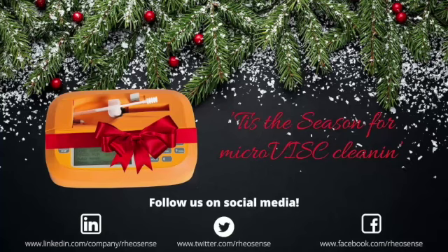All right, so now I'm gonna go into the chip cleaning station. The chip cleaning station is the automated cleaning system for your chips. This is for microVISC chips as well as MVROC chips. For the microVISC version, it comes with this handy dandy little clip, and all you have to do is, where the pipette goes into the chip, this clip will also clip into that hole as well.